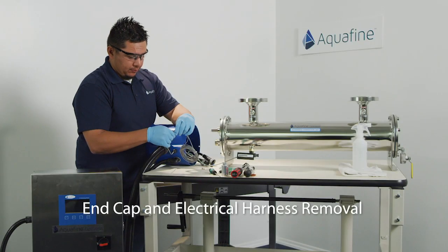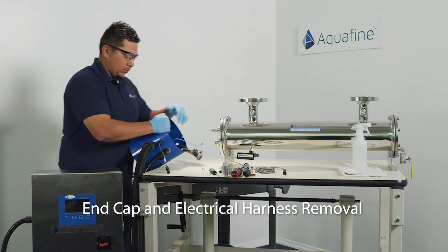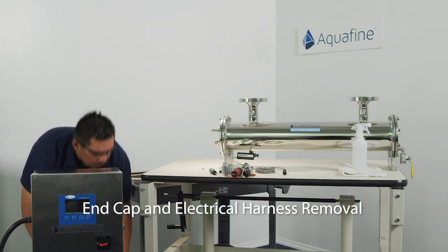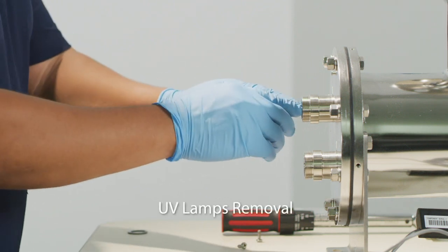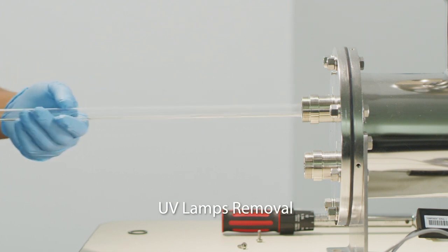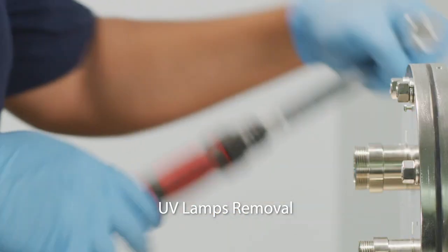With all electrical connections freed from the end of the UV treatment chamber, the end cap and electrical harness can be removed and placed away from the end of the treatment chamber. The UV lamps can be removed out of the treatment chamber by sliding the lamps out of the quartz sleeve using the compression nut tool provided with the OptiVenn and an on-site 3/8 inch ratchet.